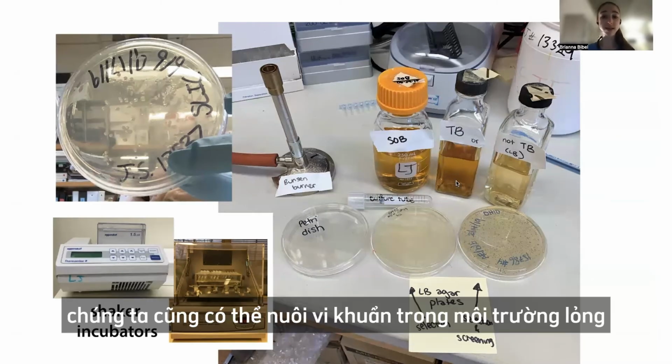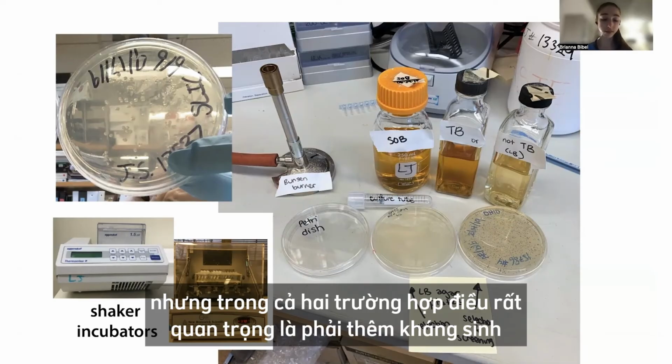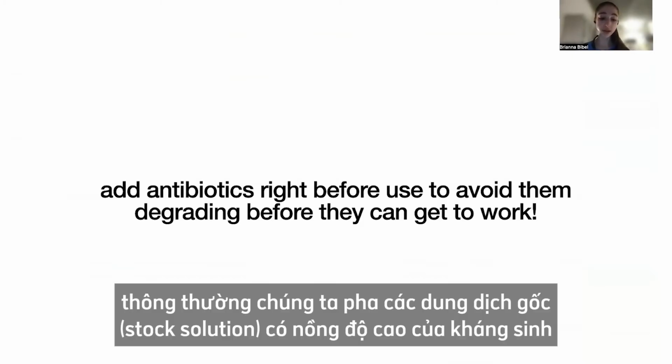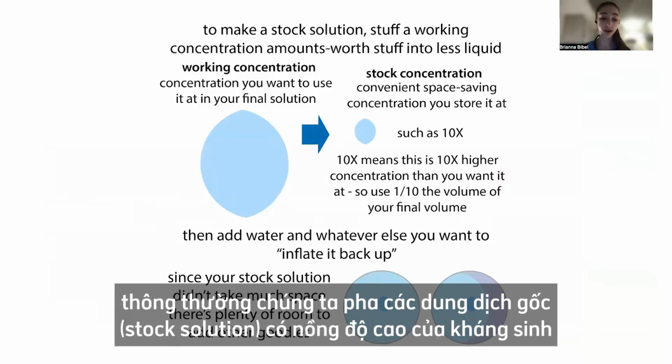But we can grow them on these plates, so we can grow them in this liquid. But in either case, it's really important that we add the antibiotics just right before we go to use them, so that we avoid them degrading before they can actually go to work. And so typically what we do is we make high concentration stock solutions of the antibiotic.